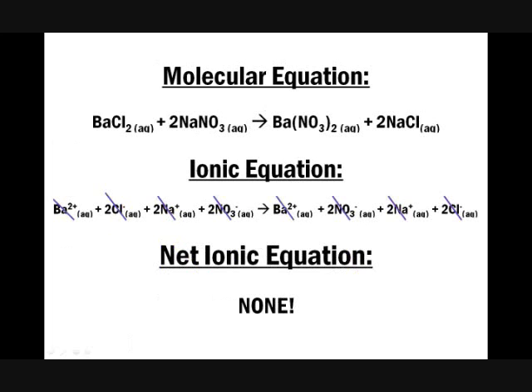Barium chloride reacts with sodium nitrate to form barium nitrate and sodium chloride. Both products, barium nitrate and sodium chloride, are soluble. That means that the solutes will dissolve in the solvent.